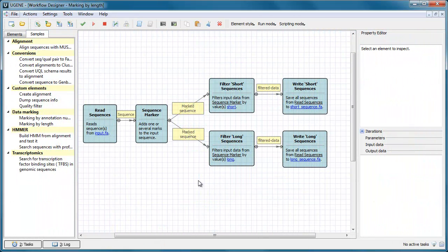Two new elements for managing data flow appeared in the workflow designer. To see them in action, select, for example, the sequence length marking sample on the palette.